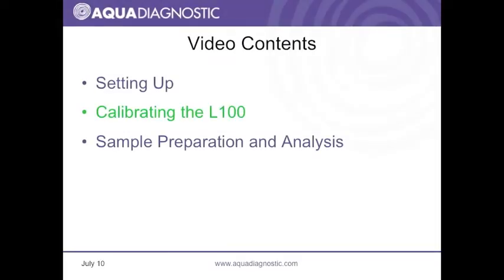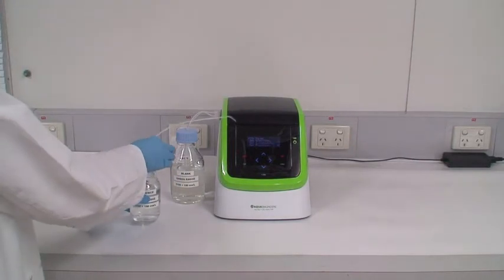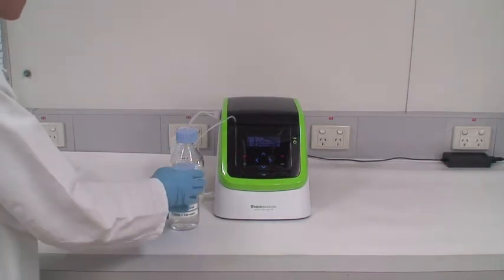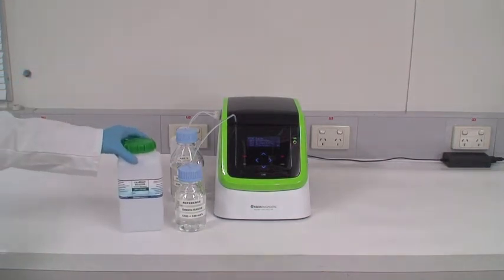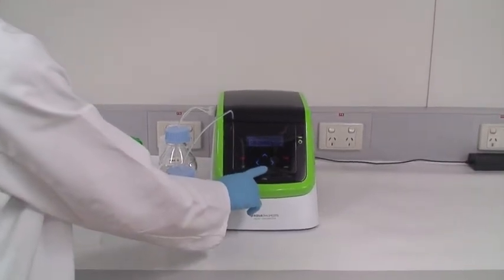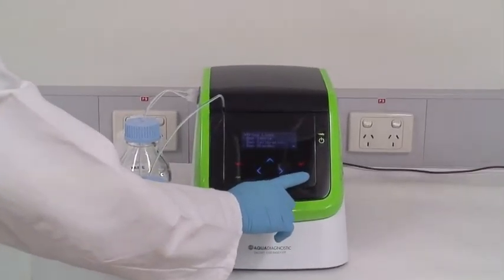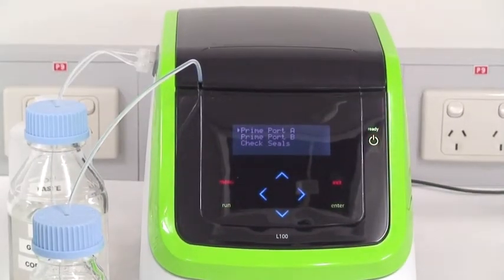Calibrating the L100. The L100 should be calibrated once per day. Present the reference solution to port A. The reference solution is made up of PCOD calibrant and PCOD electrolyte. Prime port A several times to ensure that the line is filled with solution. Each prime operation takes about 3 seconds.